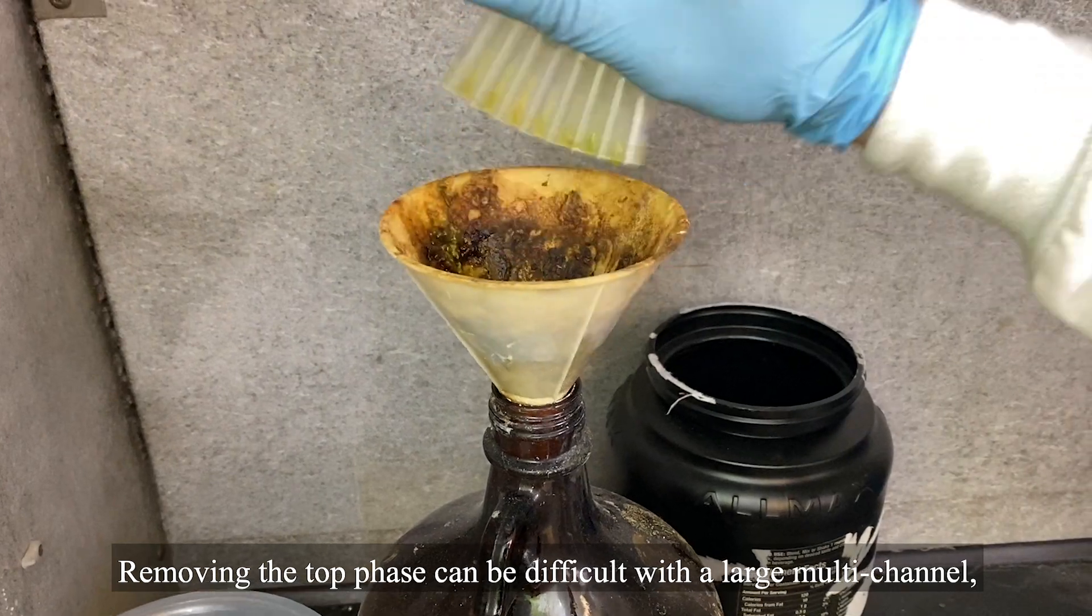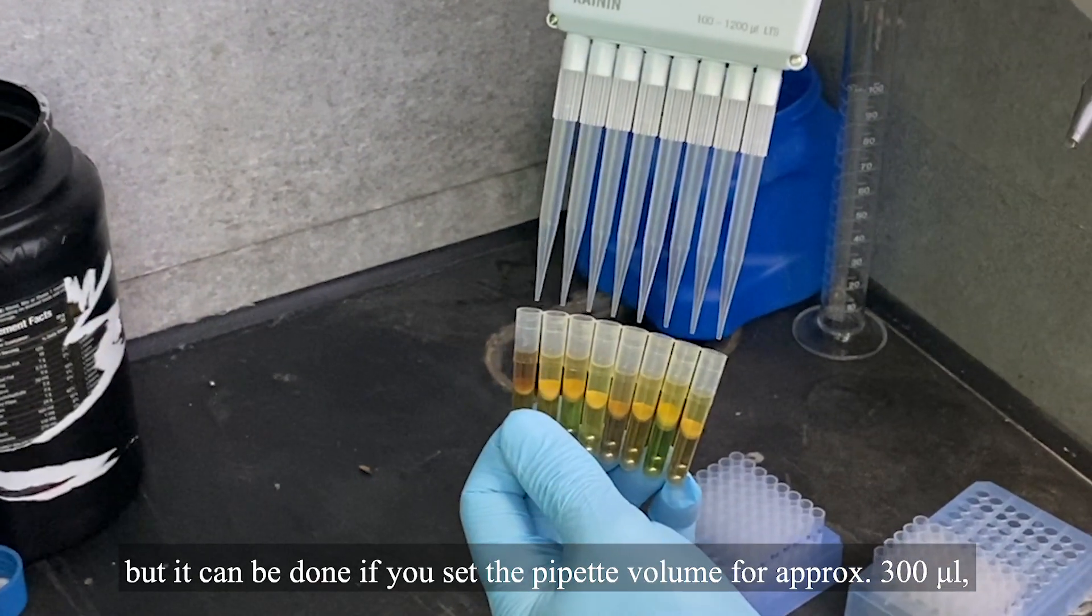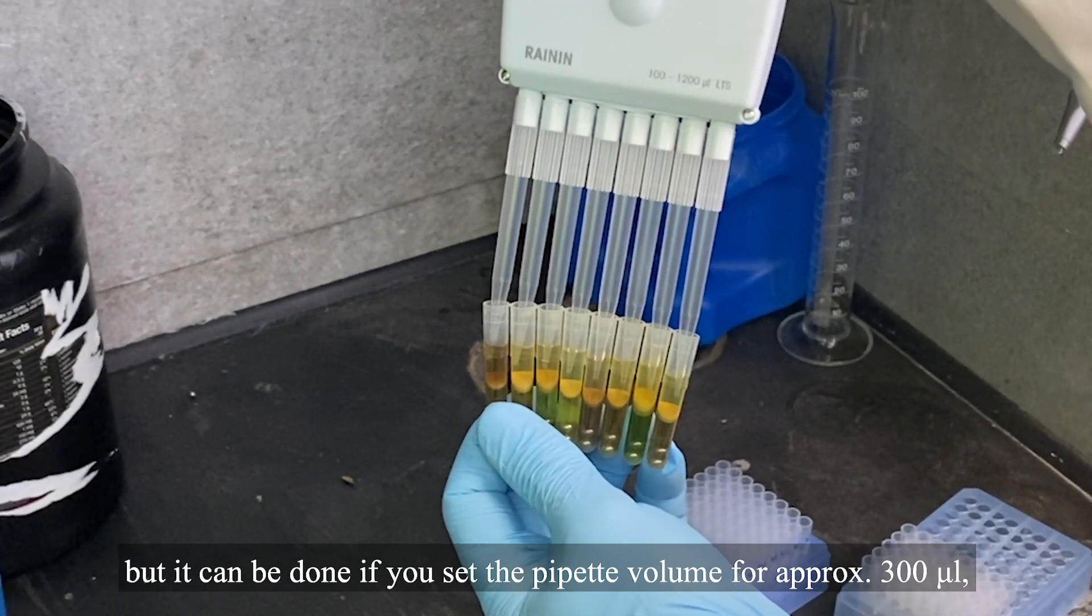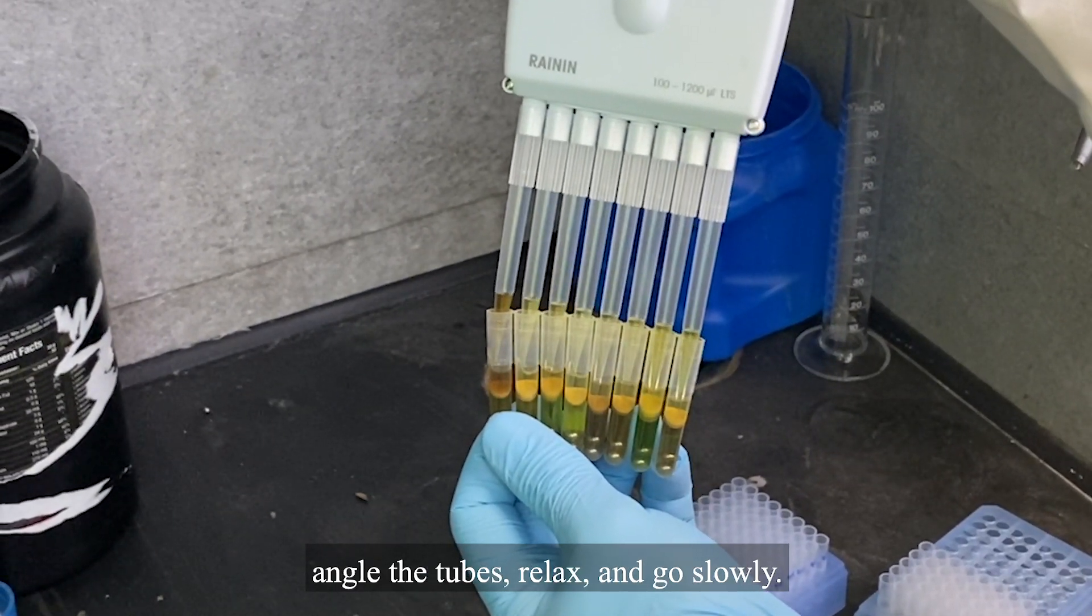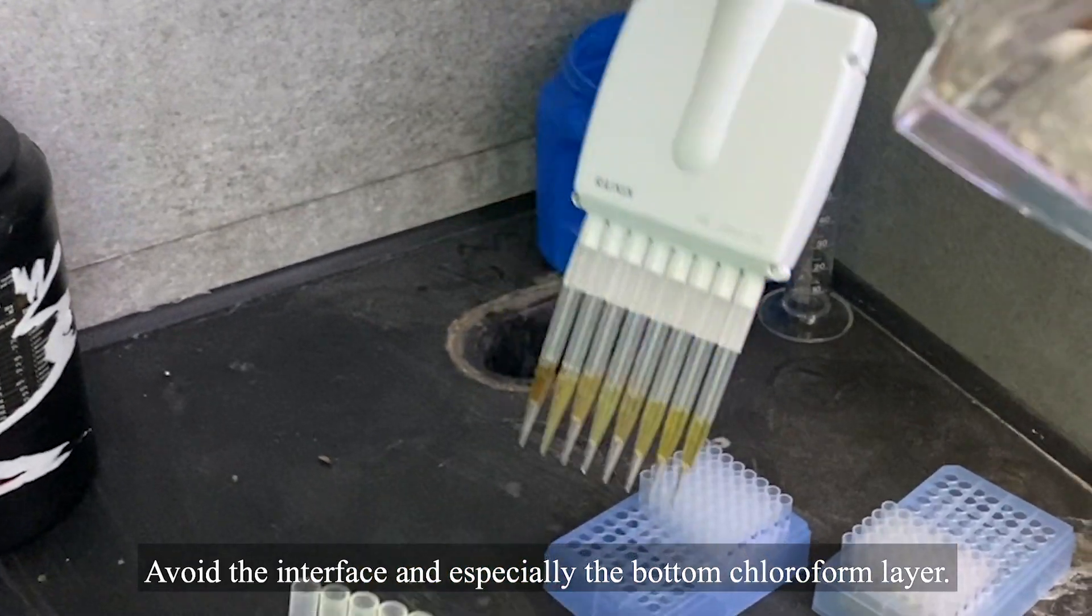Removing a top phase can be difficult with a large multi-channel, but it can be done if you set the pipette volume for approximately 300 microliters, angle the tubes, relax, and go slowly. Avoid the interface, and especially the bottom chloroform layer.